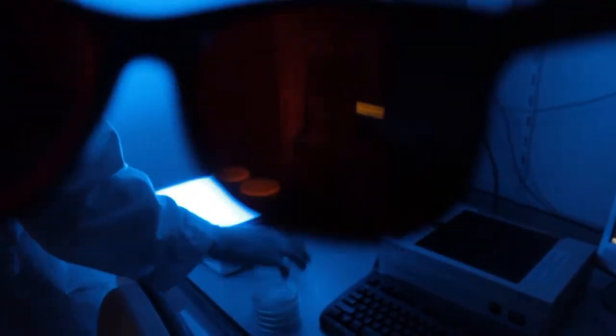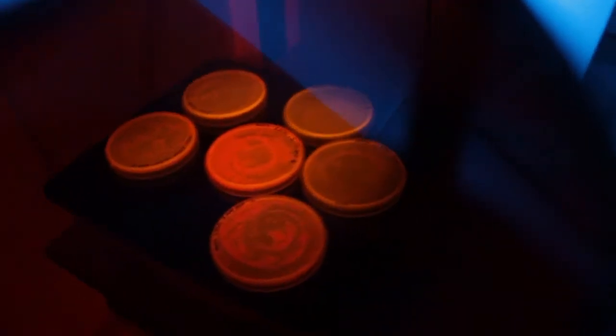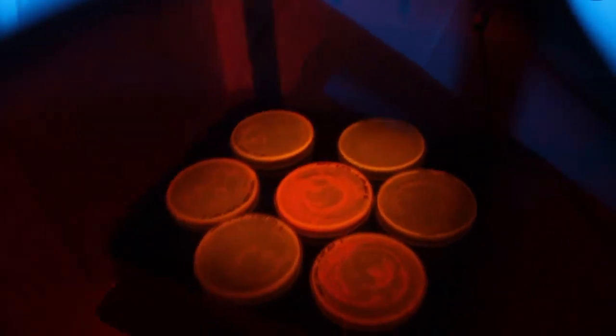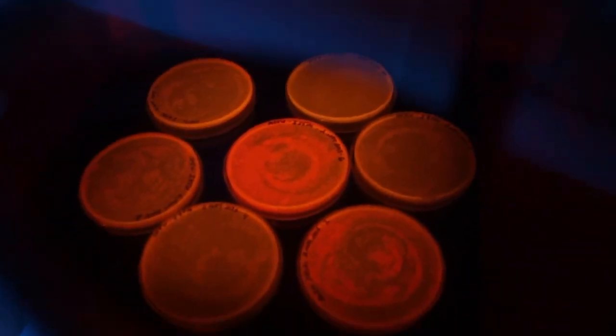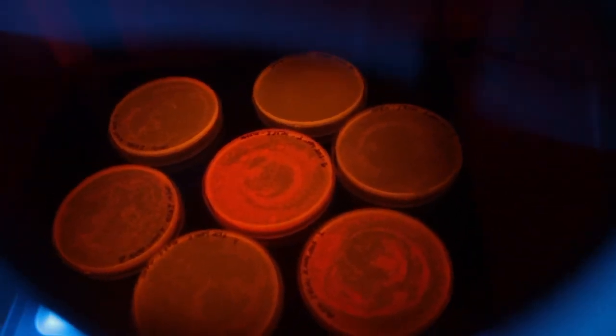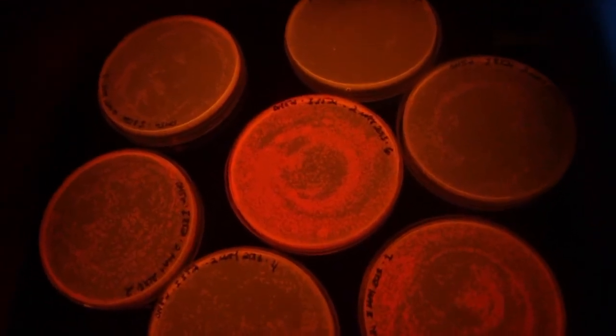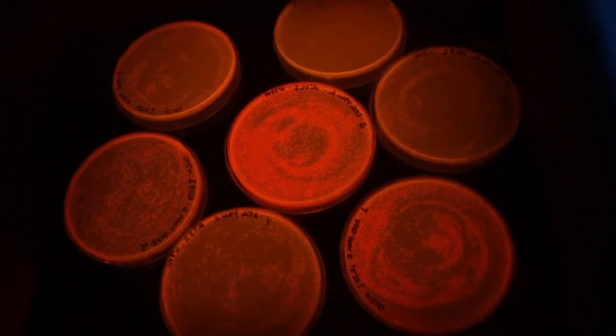And now when I start putting on these plates, you should see some fluorescence. And the ones that have grown quite a bit and done quite well for themselves, all of them are sort of red fluorescent but some are in a much more advanced stage of production.